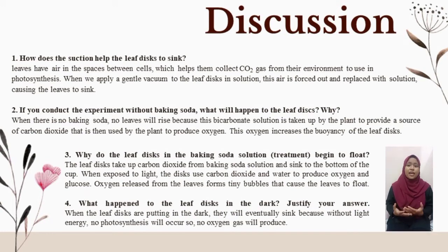The second one is, if we conduct the experiment without baking soda, no leaf discs will float, because the bicarbonate solution is taken up by the plant to provide a source of carbon dioxide that is then used by the plant to produce oxygen. This oxygen increases the buoyancy of the leaf disc.